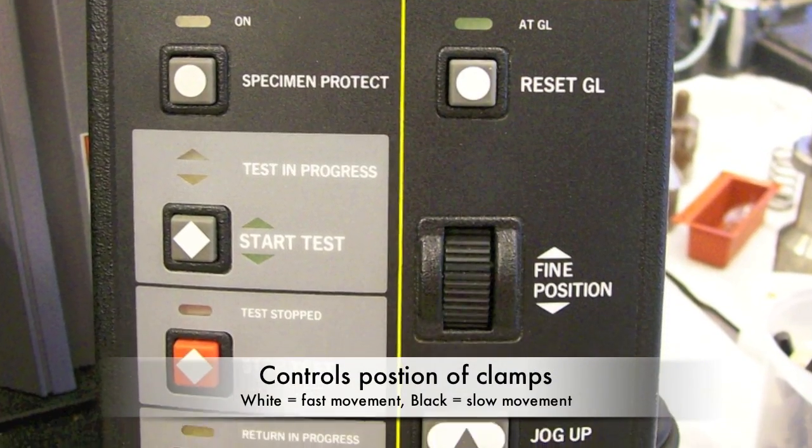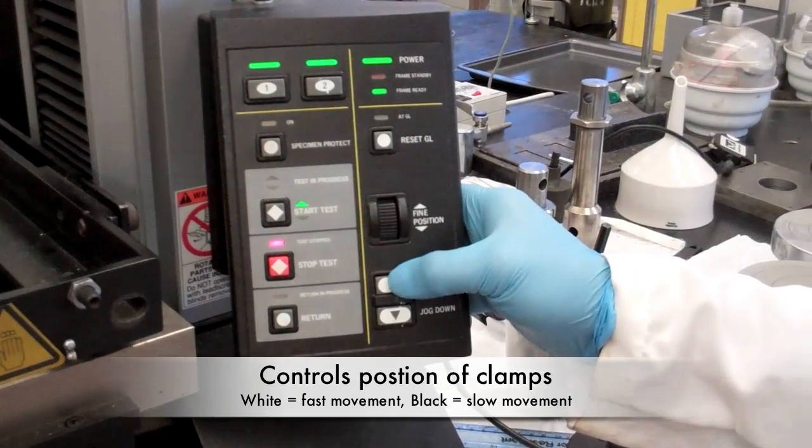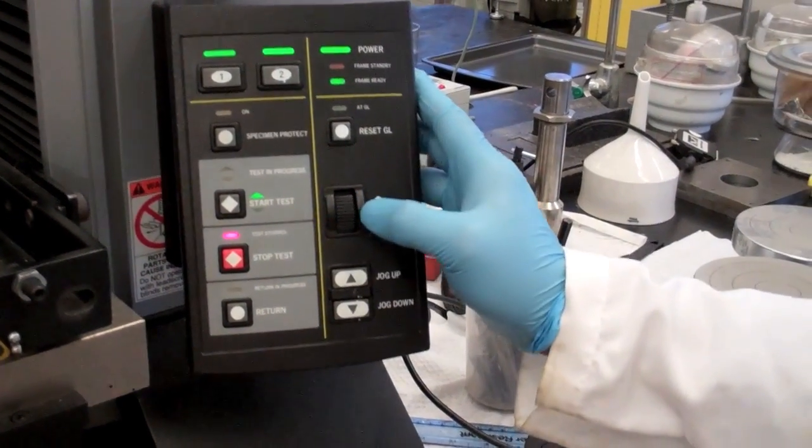The remote controller is used to position the clamps and to operate the machine. The white buttons are fast movement and the black scroll is slow movement of the clamps.